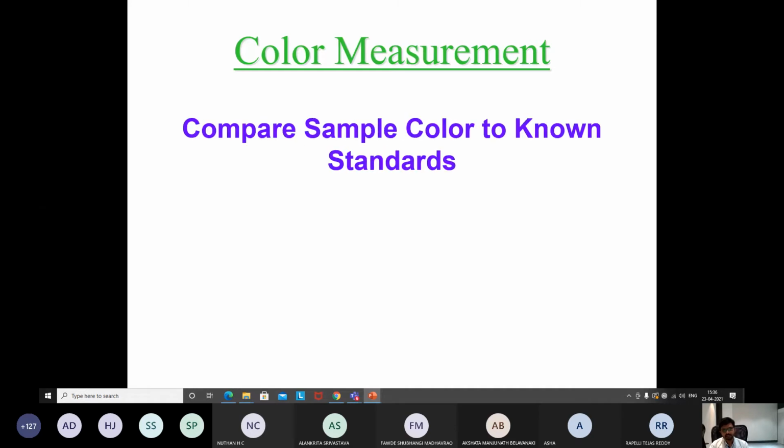So the same thing. Actually, how are you going to measure the concentration of any substance in a sample? Always we will be using the standards. Standards contain a known amount of the same substance. So if you are estimating glucose, the standard will be pure glucose molecule, which is going to react with the different reagents, and it will produce some color. Suppose 100 mg per dl of glucose is going to give 0.2 absorbance. For the unknown sample, you don't know how much concentration is there. In that condition, you are going to get the absorbance value. There is some mathematics behind this. By using those formulas, we can calculate the concentration of that particular glucose in the unknown samples.